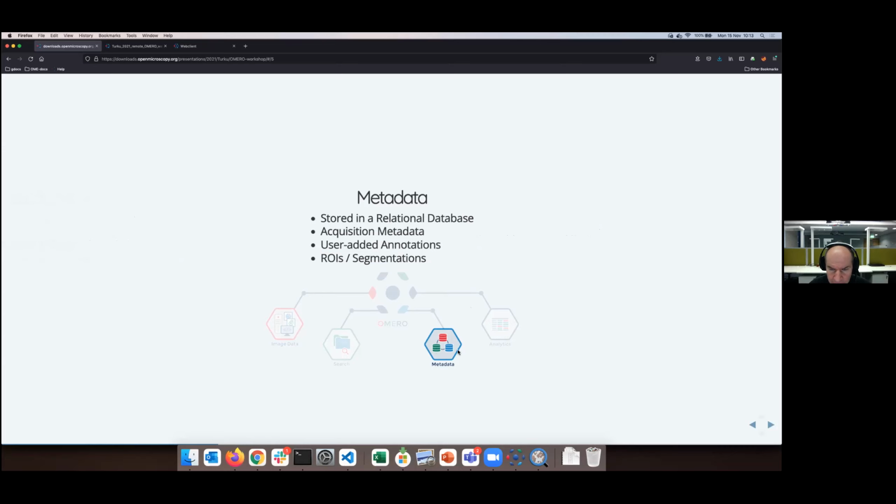We take them very seriously, and they are stored in the server in a relational database. So Omero has a database to itself as well. And the data are not thrown there on some pile. There is always care taken of what belongs to what. You can search on the server.